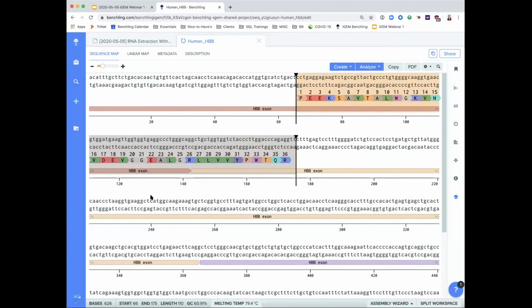And to wrap up our discussion of the molecular biology suite specifically, I want to call attention to the fact that we do have this great toolbar at the right-hand side of the sequence, but we also have the ability to manipulate the sequence in almost all the ways that we've discussed with a simple right click. So you'll notice if I click and drag, I have a particular part of my sequence.